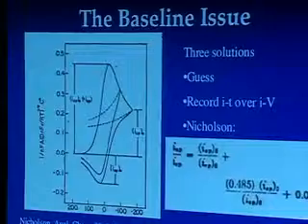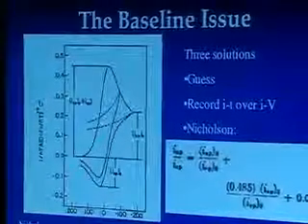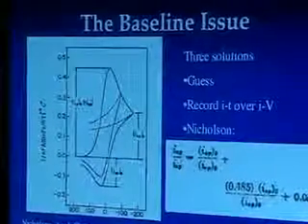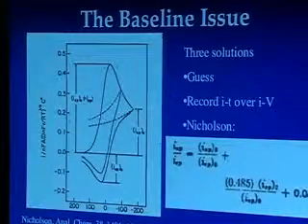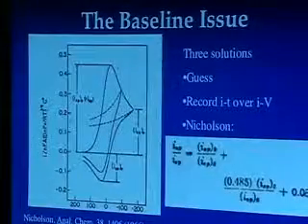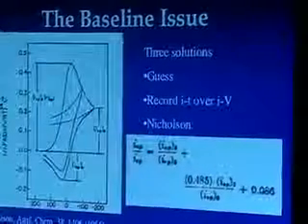You should be measuring from that baseline, and that baseline value can vary depending on exactly what scan rate you're using, because that determines the time, as well as where your lambda point is. So quite obviously, if I turn here measuring a baseline from there versus turning here measuring a baseline from there, that is a big difference. So what do we do? Well, you have 3 options, and they're listed there.